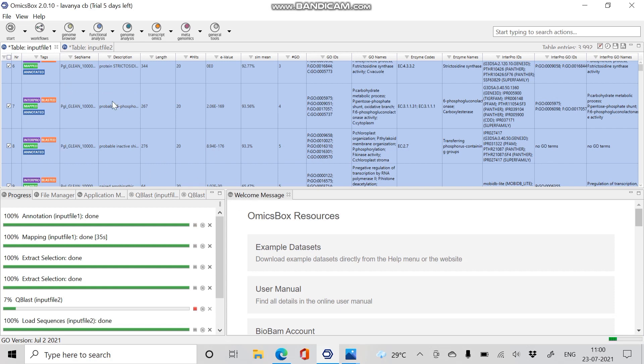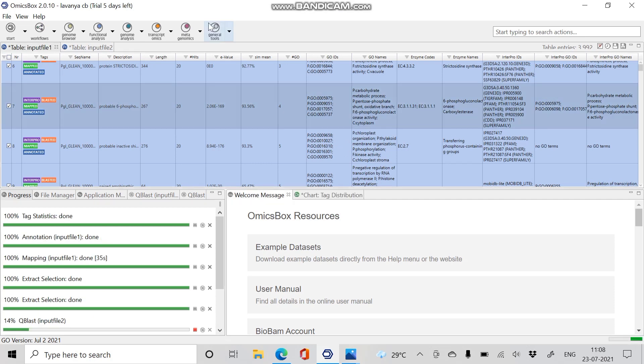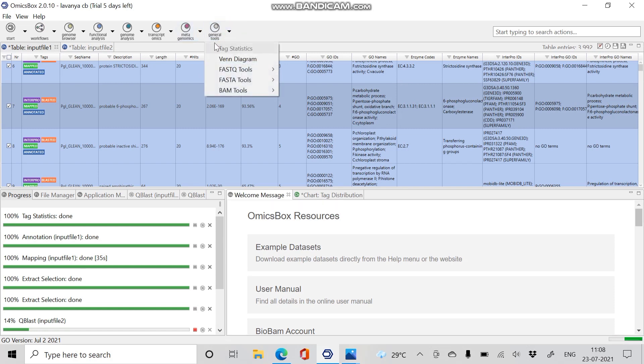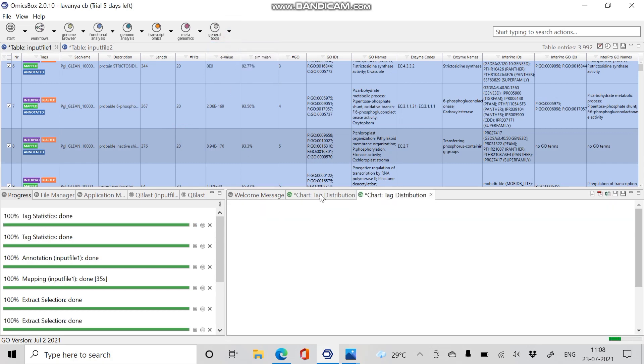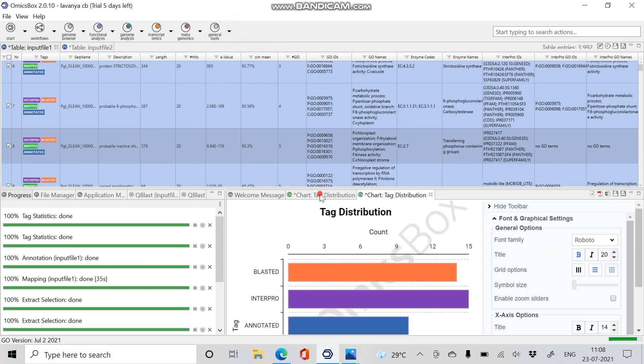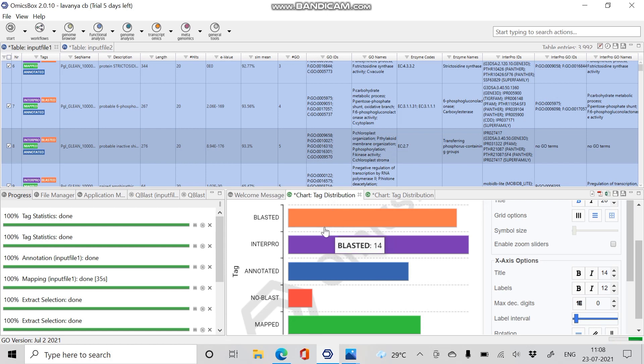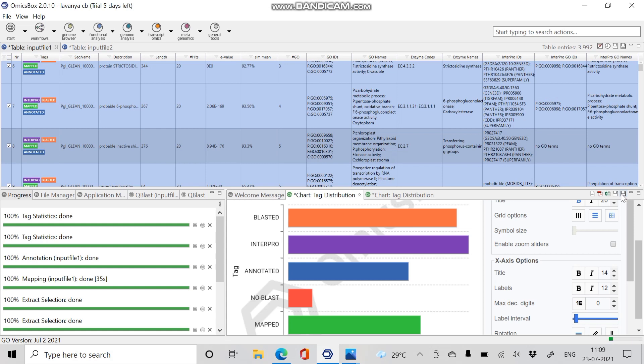It holds the identified GO names, GO IDs, enzyme names, enzyme codes, InterPro IDs and names of all the input sequences. We can view the statistics of our input sequences proceeded with BLAST, InterPro, mapping, and annotations. For that, click on General Tools and select Tag Statistics. The chart tag distributions gives the number of sequences that have been blasted, number of sequences that have undergone InterPro, and the sequences that have been annotated and mapped. We can save this file by clicking on Save As option on the right corner toolbar.